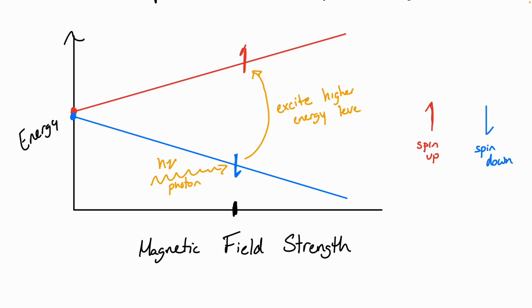Molecules will absorb these very weak radio waves. And why are they absorbing these radio waves? Because these radio waves are flipping the spin of their nuclei. And yes, everybody's like, oh, totally, I totally see that, that's exactly what my guess was from the jump, right? No, this is very weird, bizarre quantum mechanics. The fact that a particle has a spin to begin with is not a no-brainer concept. It takes a little bit of imagination to see what's going on here. But this is what NMR is doing. These radio waves are being absorbed, and they are exciting these spins from low spin to high spin, or from spin down to spin up.